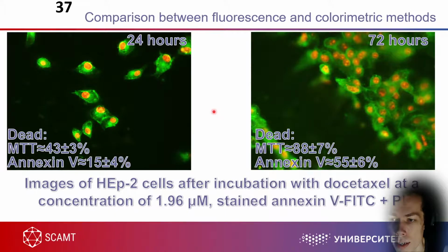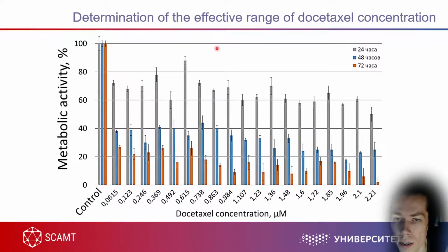But the question is why this looks like stages, as you can see, it's almost a horizontal stage. Maybe some decline, maybe just a very slow decline, because this drug works only during mitosis. And in this particular example, all of the cells were in G0 or G1 phase. So this was a synchronized cell culture, and there was no mitosis in this culture.